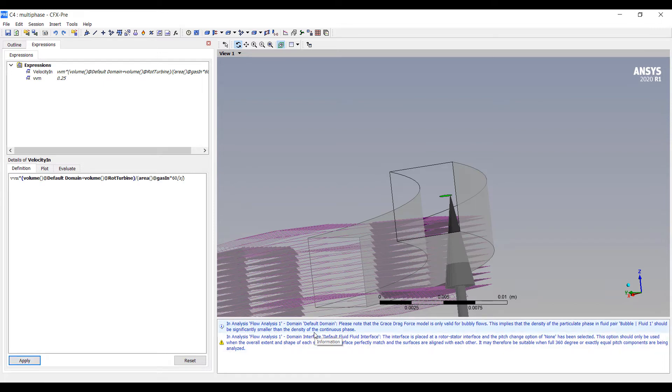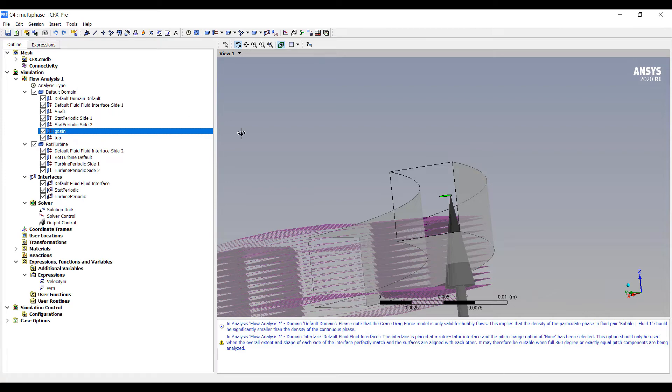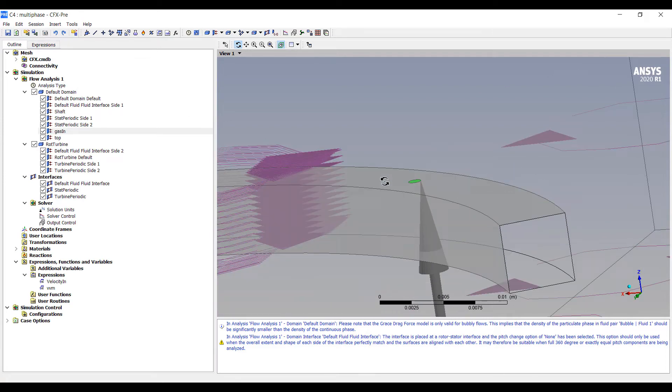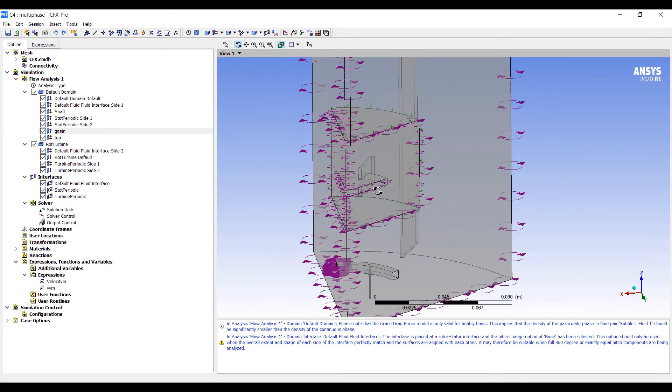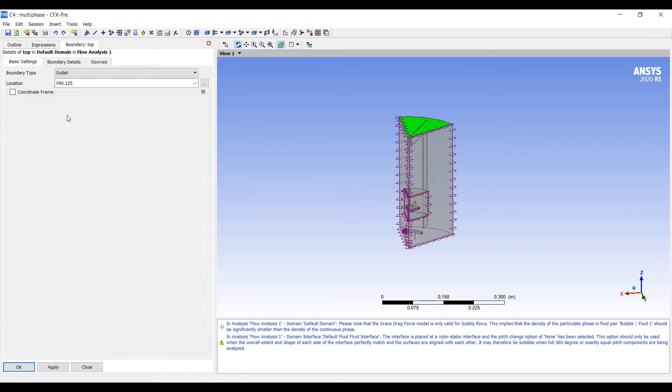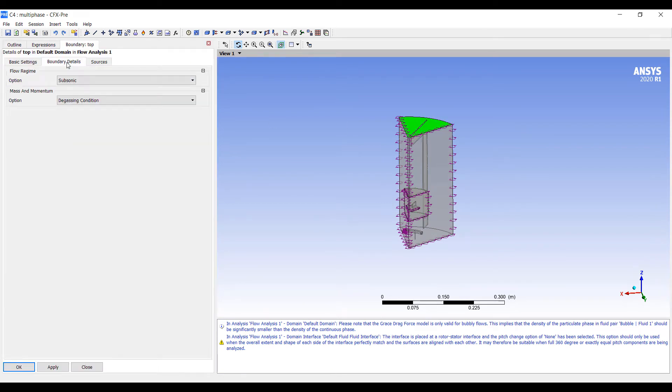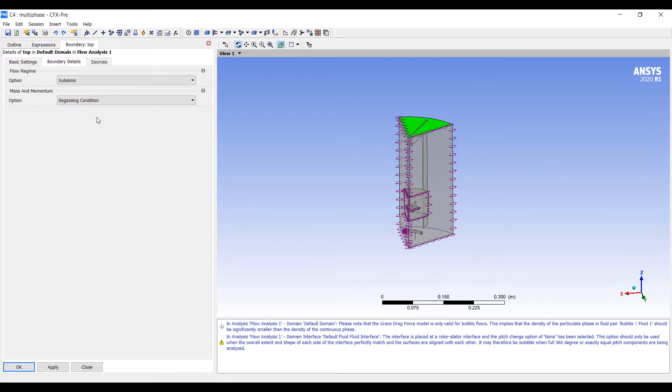There's a couple notes here. Drag force is only valid for bubbly flows. Density of the particulate phase. This bubble should be significantly smaller than the density of the continuous phase. Grace is for bubbly flows, which is what we want. That's pretty much all we have to do to set up this model. We have periodic boundary conditions, bubbles coming out here. We have the top here as a degassing boundary. And this allows us then to set up our simulation.